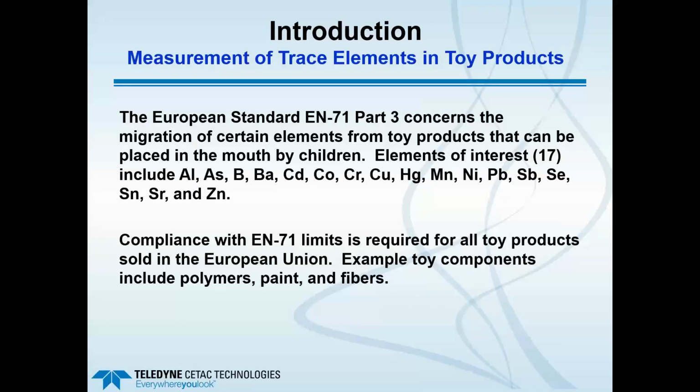The particular part we're interested in today's webinar is EN71 Part 3, and that concerns the migration of certain elements from toy products that could be placed in the mouth by children. The elements of interest are listed below, and there are a total of 17, including chromium-3 and chromium-6 and organotin. Compliance with these EN71 limits is required, again, for all toy products sold in the EU. Toy components could include polymers, paint, and fibers.